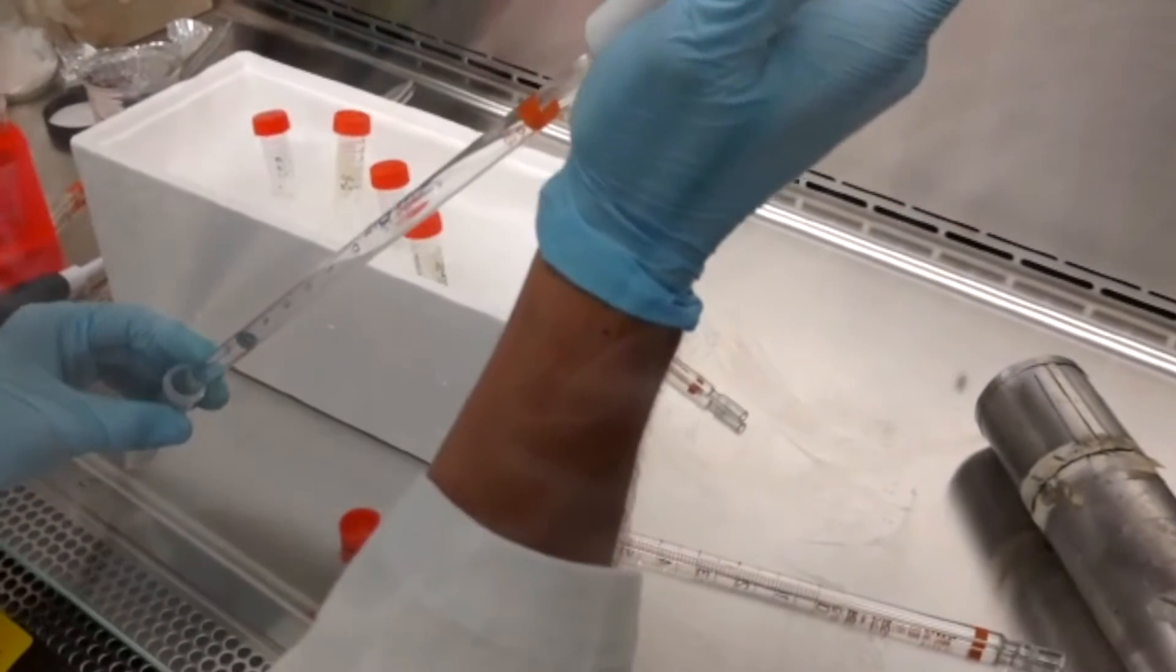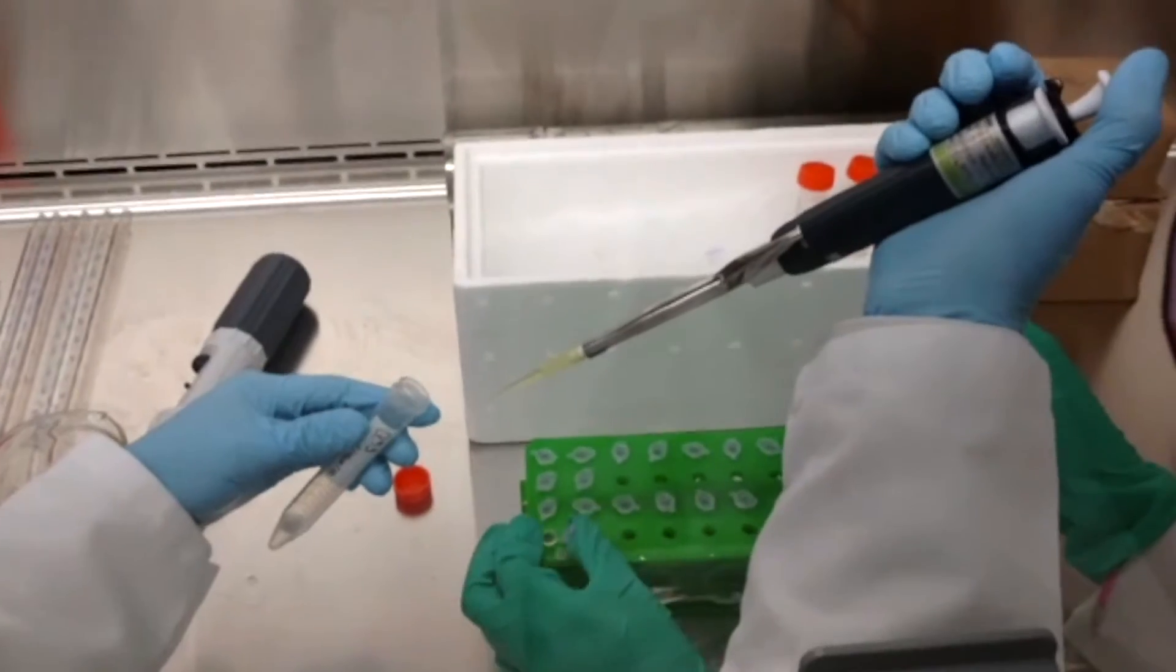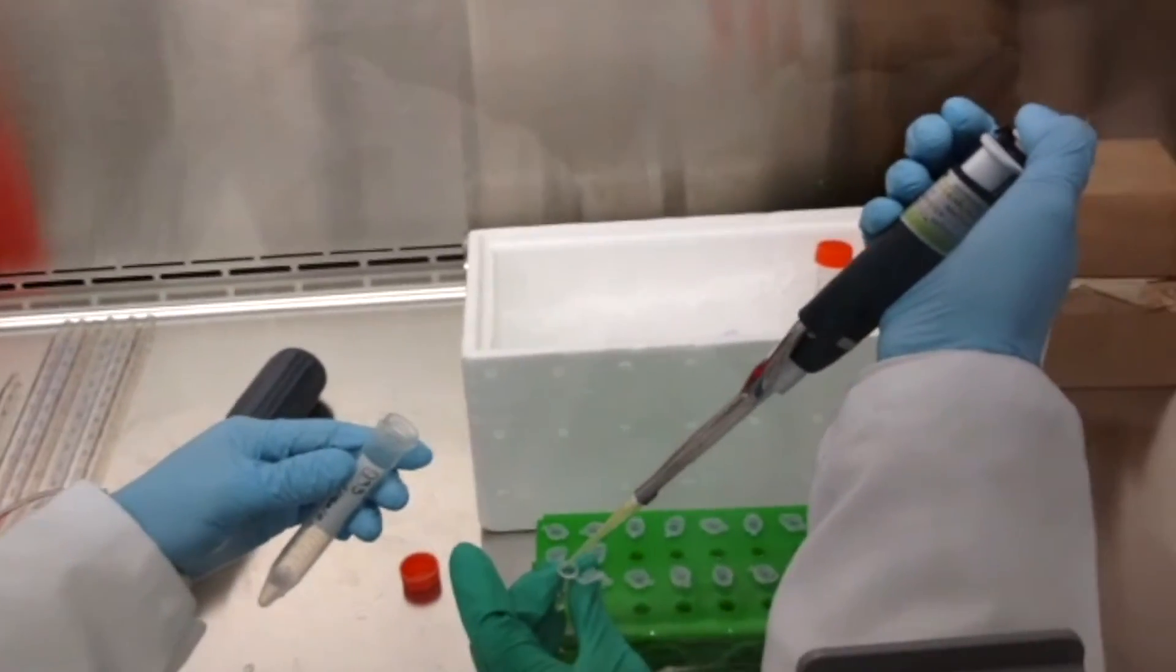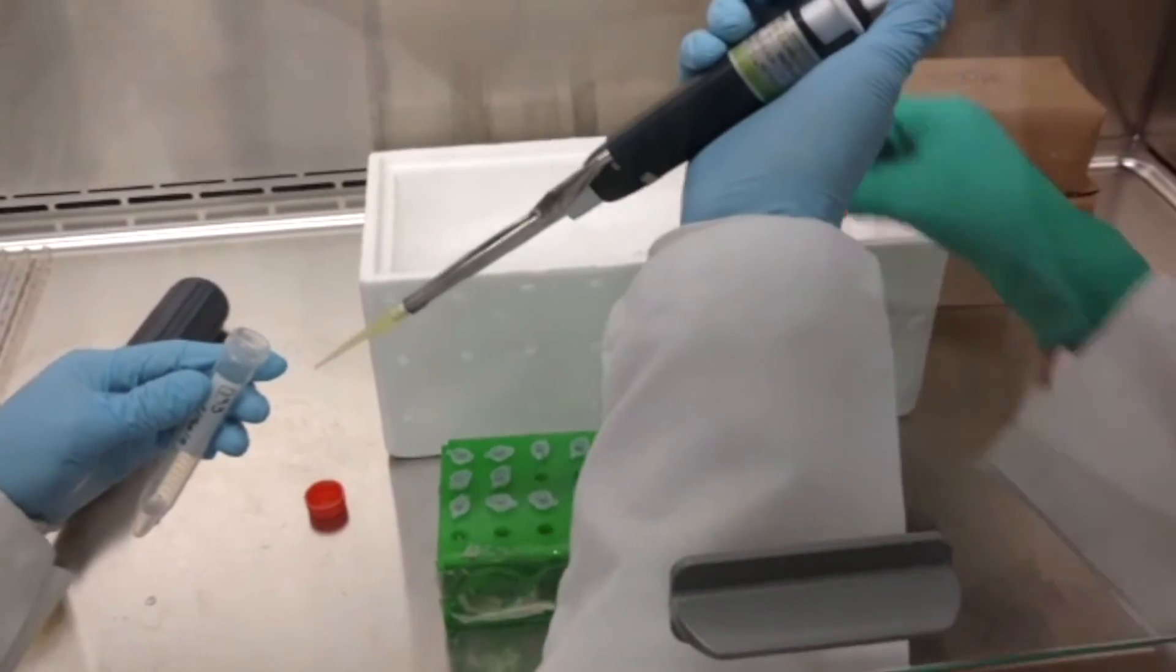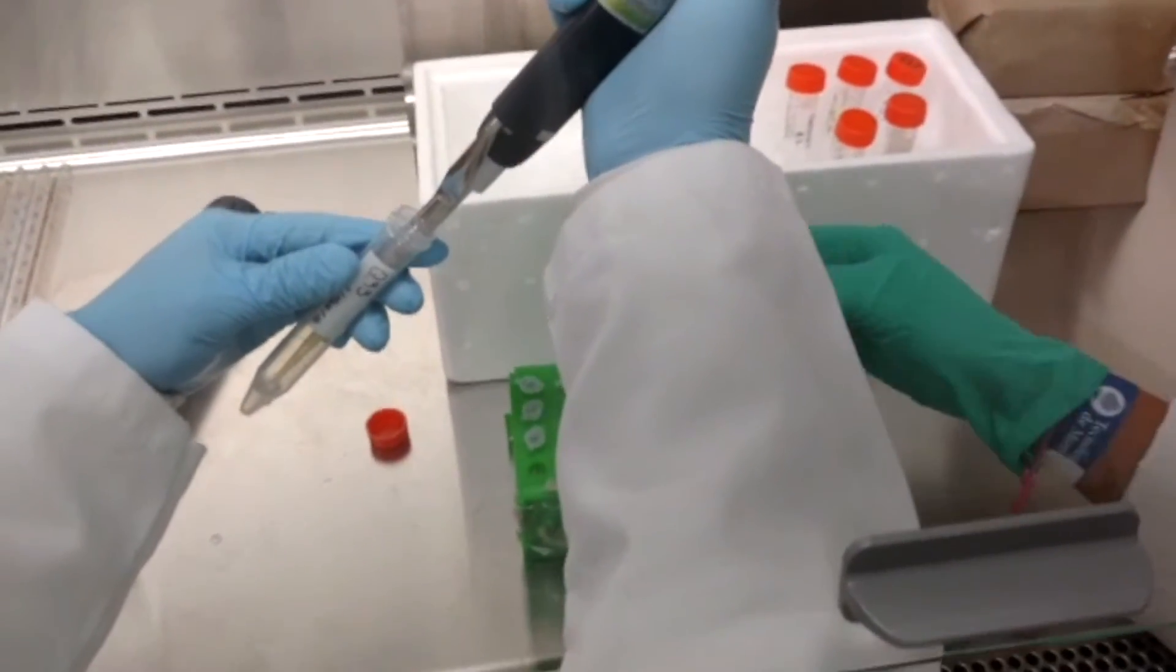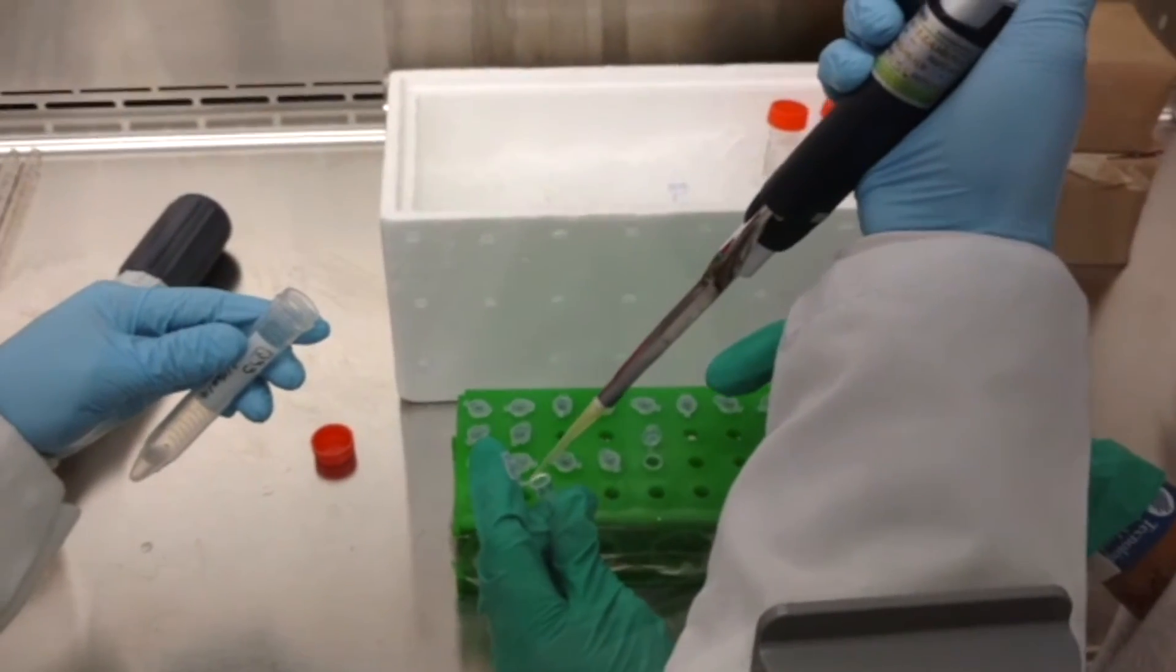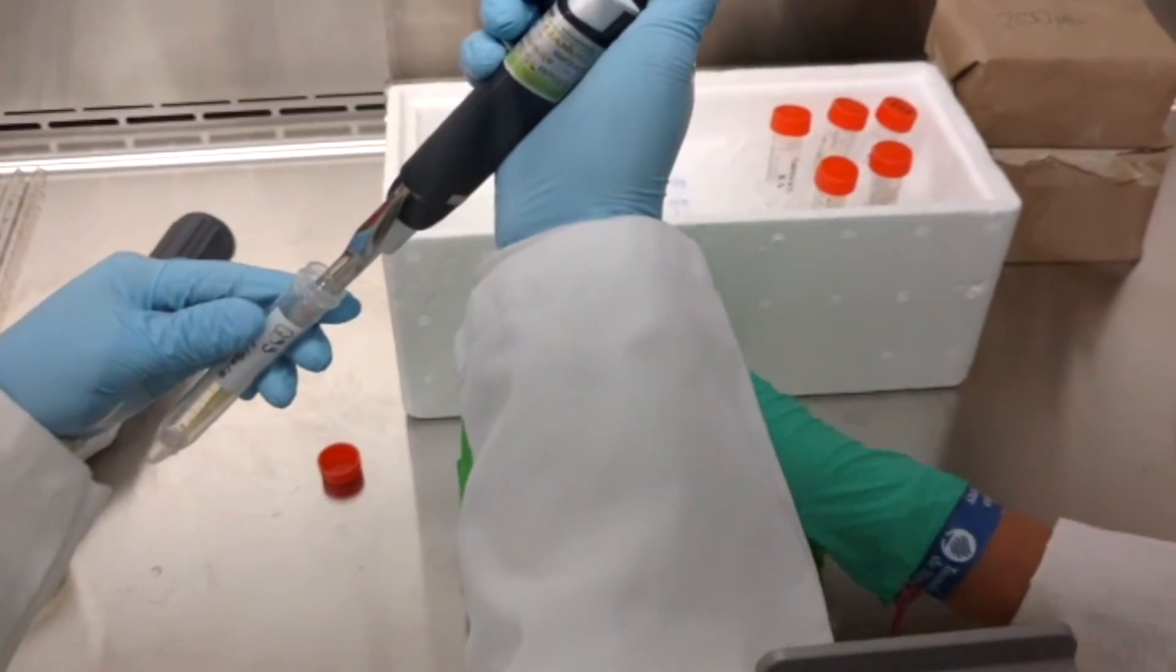The electroporation transformation efficiency was zero. This could have happened because the cells reached the bottom of the electroporation cuvette and the electric pulse didn't affect the bacteria. The use of thinner micropipette tips could help to deposit the sample at the bottom of the electroporation cuvette. It is also possible that the recovery time adjustment to fit the class times didn't allow the cells to start synthesizing the recently acquired genes, so ampicillin resistance was not activated and the cells died. Also, a longer recovery time in the shaker after the heat shock could result in a higher transformation efficiency.